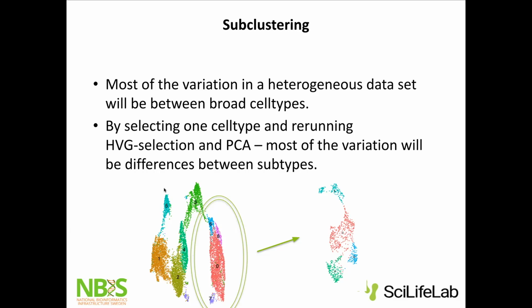Because it will quite often be the case that all these clusters here will have similar marker genes when we're comparing them versus the rest, right? So if we're just doing each versus rest, they might all have the same marker genes, more or less. But then if we start comparing them within each other, they might also have really interesting marker genes that make some biological sense, and they may not. And if they don't, I would say there's no point in splitting into more subclusters.